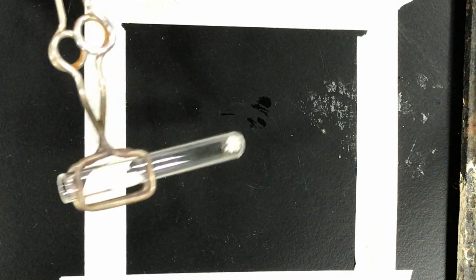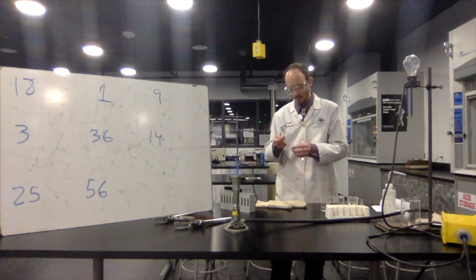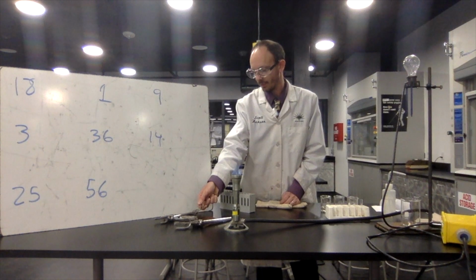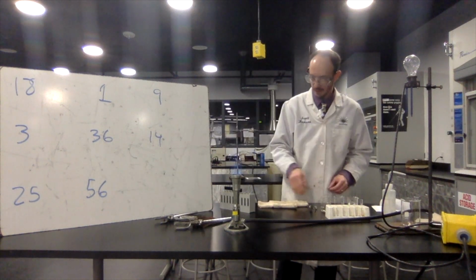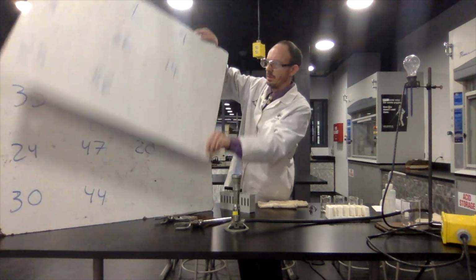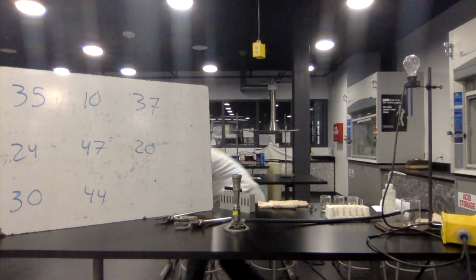No melting at all. It's still in its crystalline form. No even singeing. So there's that one done. All right. Next card.